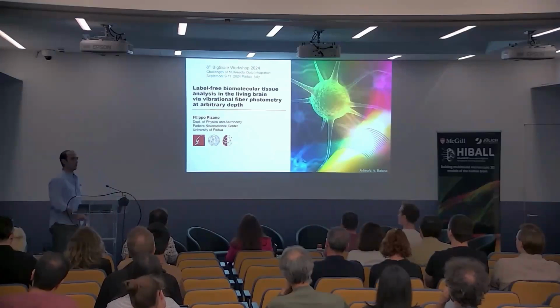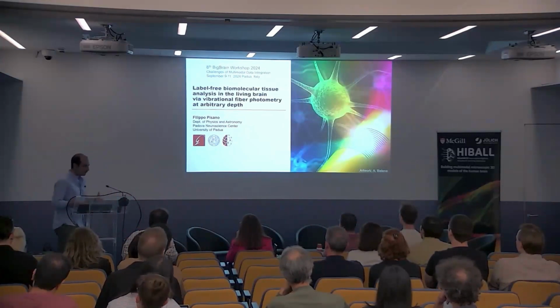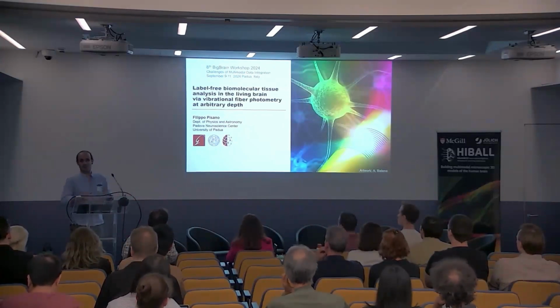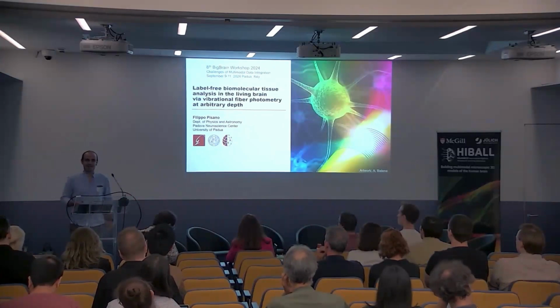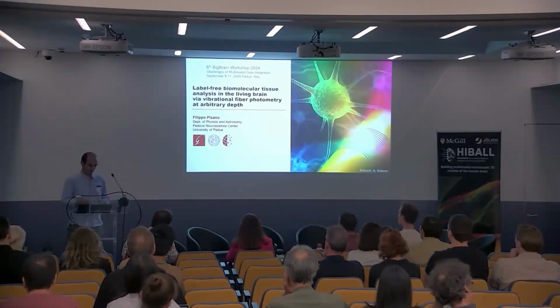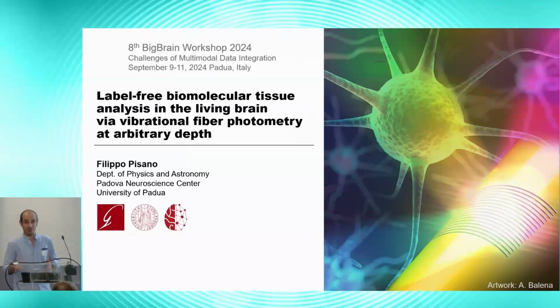I'd like to show some of the work we've been doing recently on a technique for label-free biomolecular tissue analysis at arbitrary depth. This will be mostly in the mouse brain, so I understand this is not the exact model you're all working on, but in perspective, it might be something that is interesting for all of you. So I'm a physicist. I'm here at the Department of Physics in the Padua Neuroscience Center. So this will be the take of the presentation, and I'll be more than happy if you'd like to discuss about something in the following.